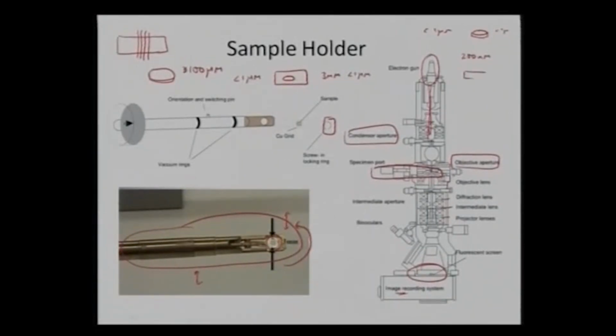So what I will have is a thin disc which is approximately 100 to 200 nanometer in thickness. If the sample is conducting, I can apply some corrosive or some media which can start eating away this particular material. So I can start throwing some media. This is an enlarged view. I can start throwing in some media from both the sides until it starts eating away the material and creates a very fine hole in the center of the disc.